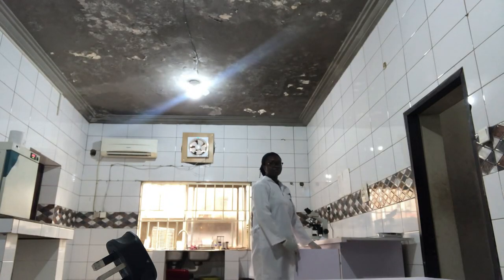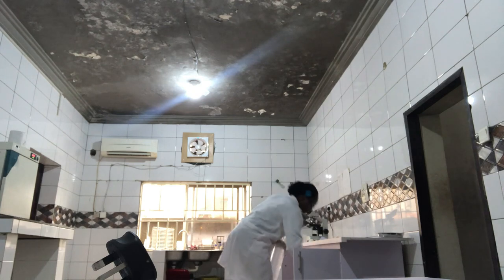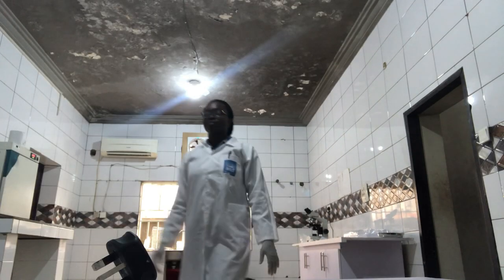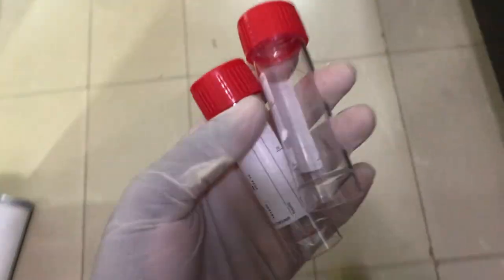At this point I start to bring out the petri dishes that we will use to pour out the media that we are preparing. I forgot to collect blood because we are preparing blood agar, so here I am going to the phlebotomy to ask for universal tubes, and I am going to be taking these tubes upstairs to the lab to collect blood.